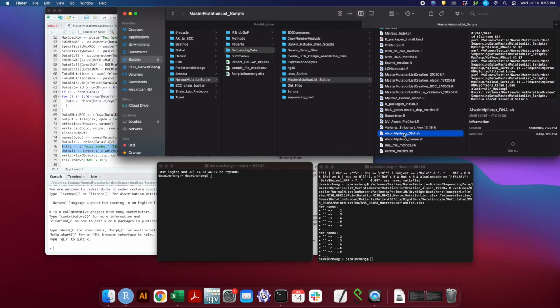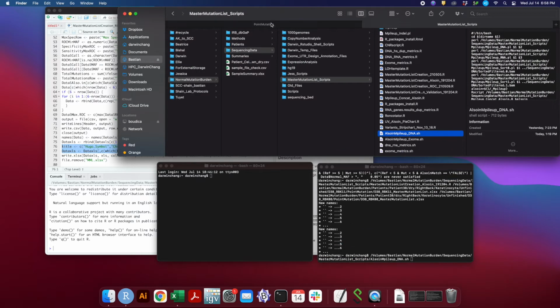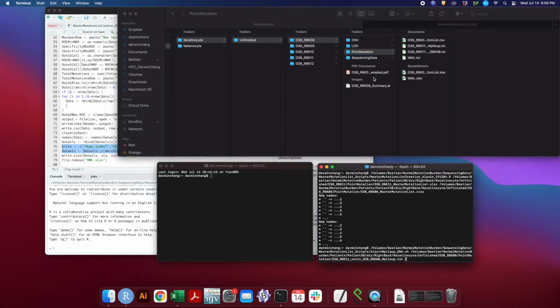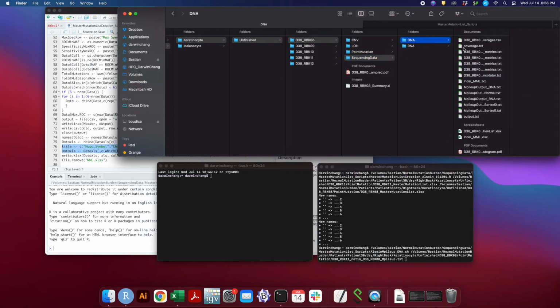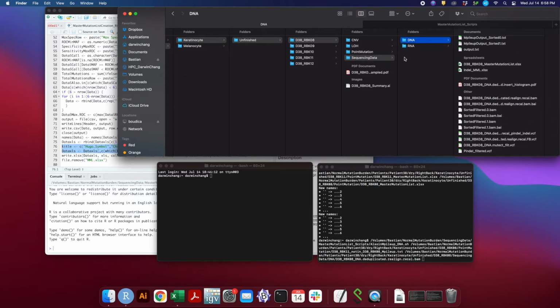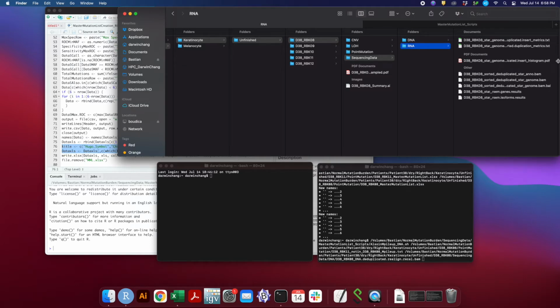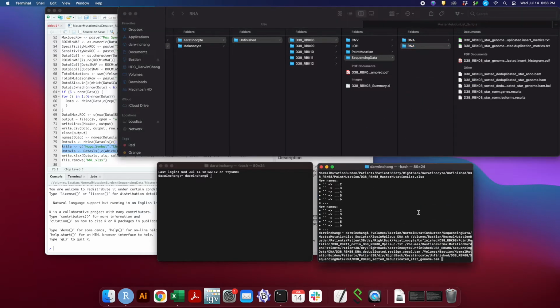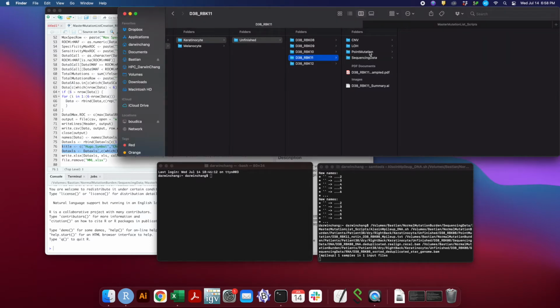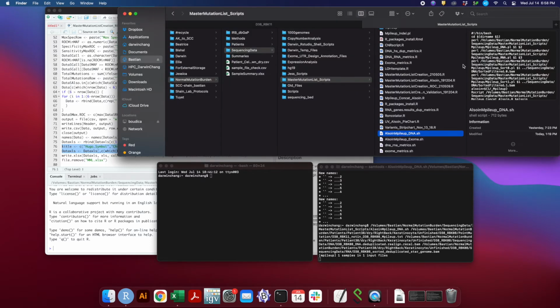So first we want to drag the DNA script, the MPileup text, the DNA of that sample, the realigned, recalibrated BAM, and the star genome RNA BAM. We want to do the exact same for the other sample, the other related sample.